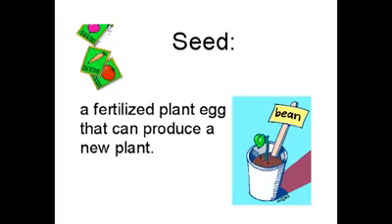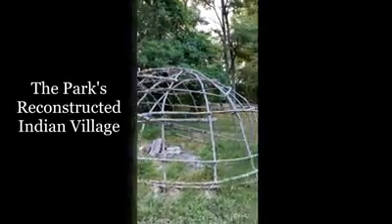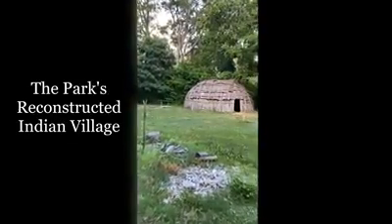Well, if archaeologists recover seeds and other plant remains from archaeological sites, we can tell what types of food people ate, how they used plants in other ways, like for baskets, for example. And we can also talk about what the environment was like at the time that the site was occupied. So this week, we're going to do a hands-on activity for students that will help demonstrate how paleobotanists work in the lab to identify the seeds that they find from archaeological context. And we're going to do this today using modern materials.